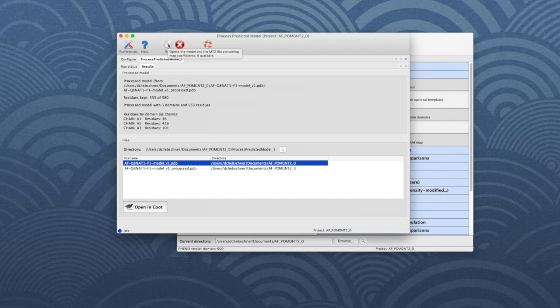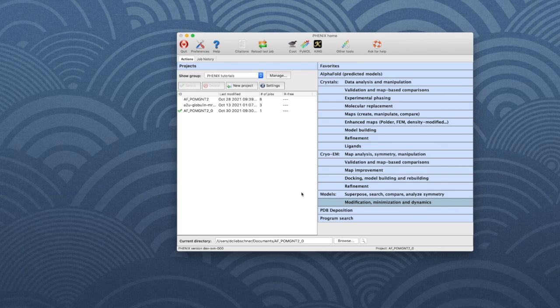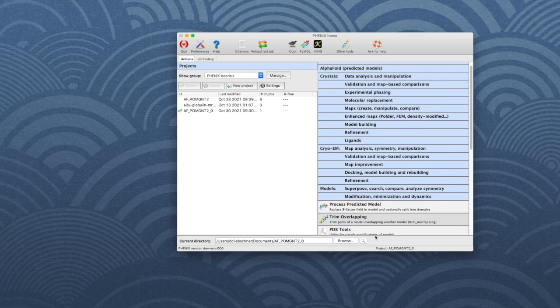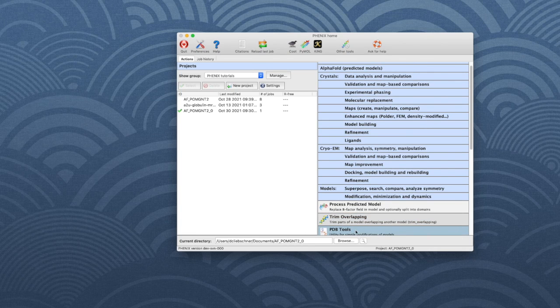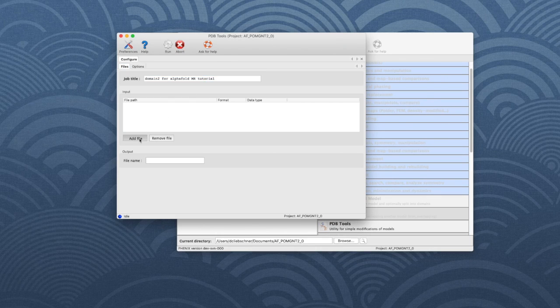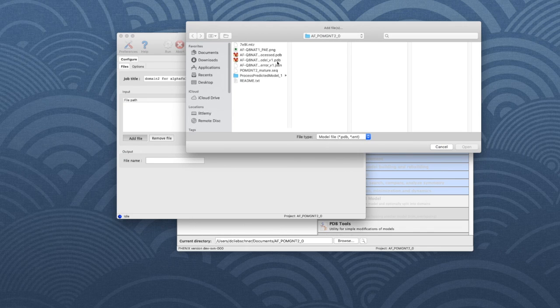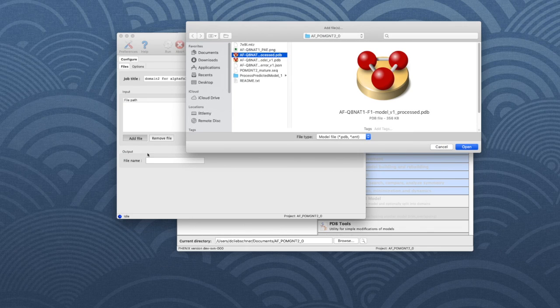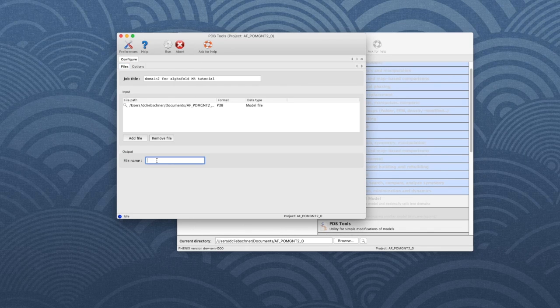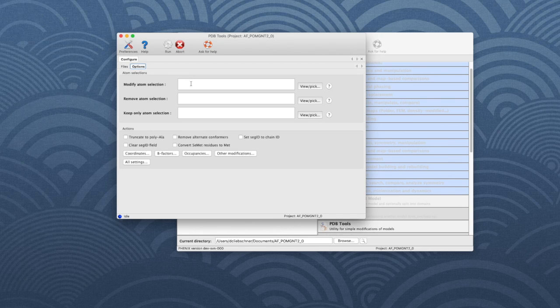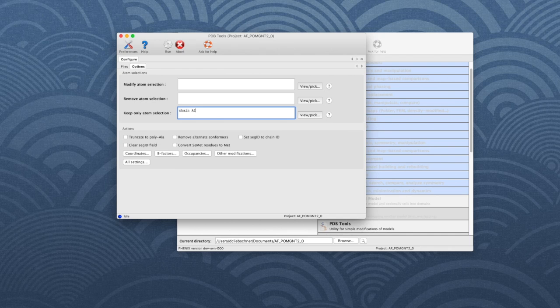We will now use the program PDB tools to create two separate model files, one for chain A2 and one for chain A3. In the main Phenix window, go to Models, Modification, Minimization and Dynamics, then choose PDB tools. Enter a job title, click Add file and choose the output file from the process predicted model program. Choose an output file name, such as domain_2. Go to the Options tab and put chain A2 into the Keep only atom selection field. Click Run.